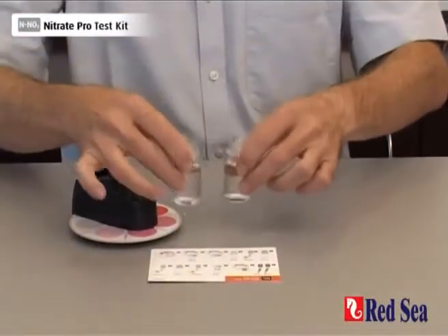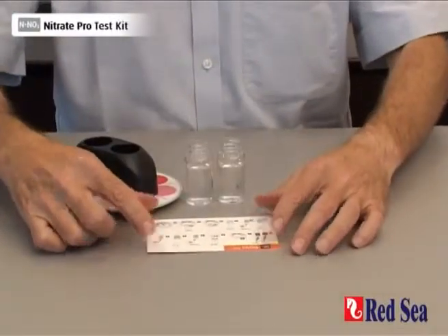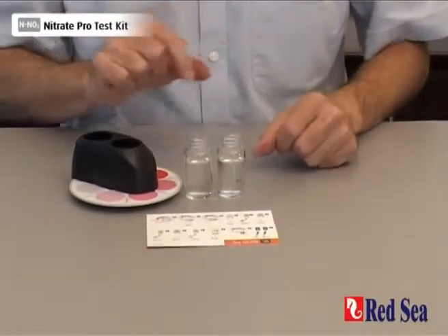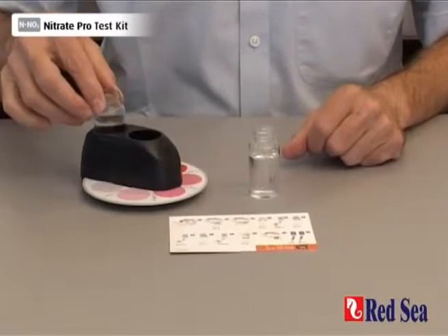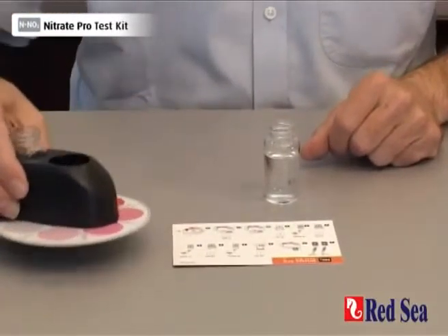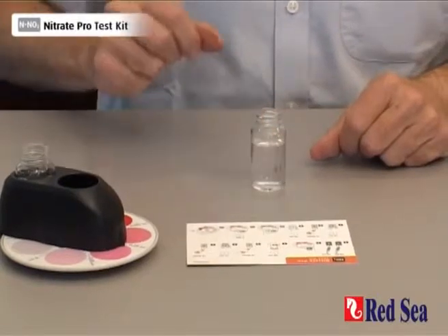I have prepared two vials, each with 16 ml of water from the aquarium that we are testing. Take one of the vials and place it into the outer hole of the comparator and put it to one side. We'll now do the reaction in the other vial.